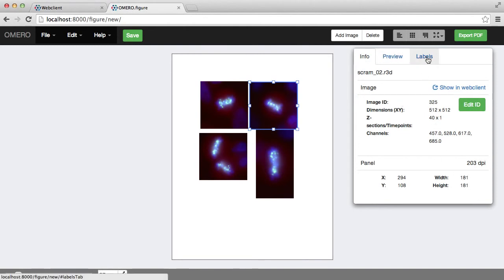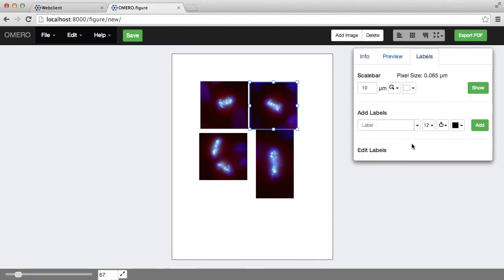And then the panel to the right is where I can add scale bars and labels.